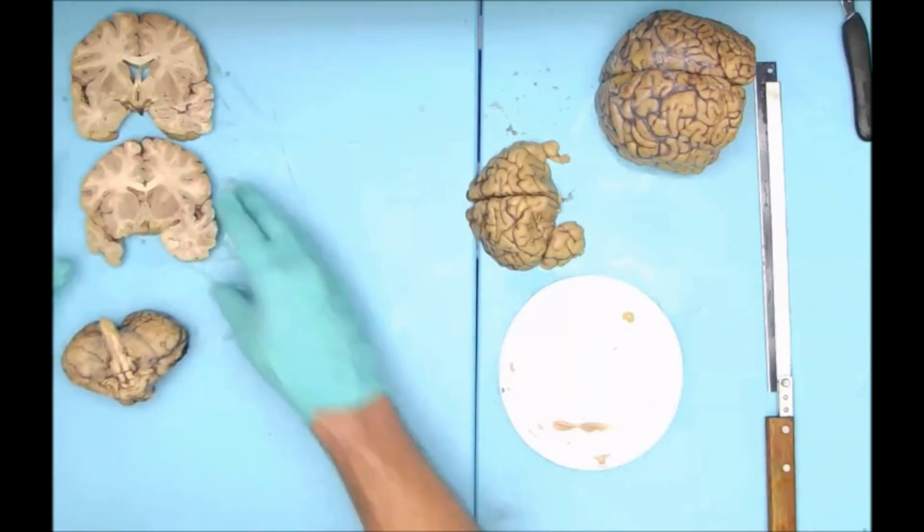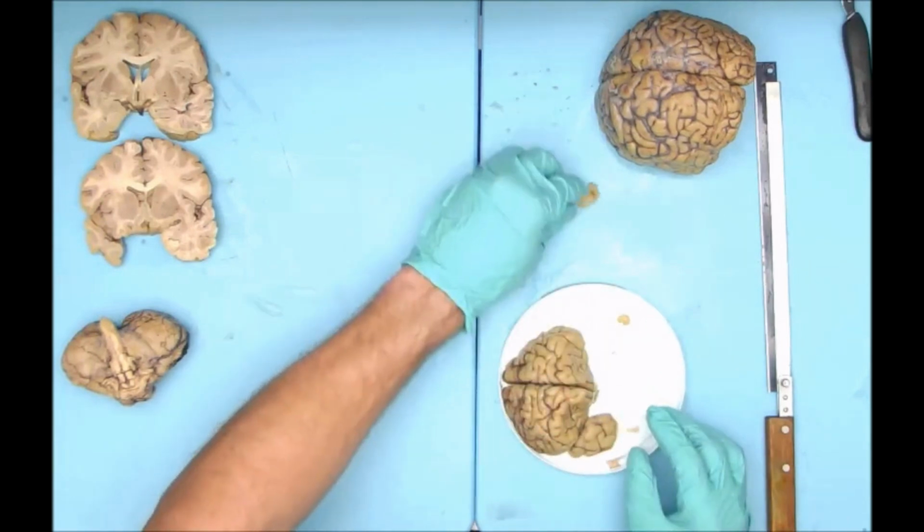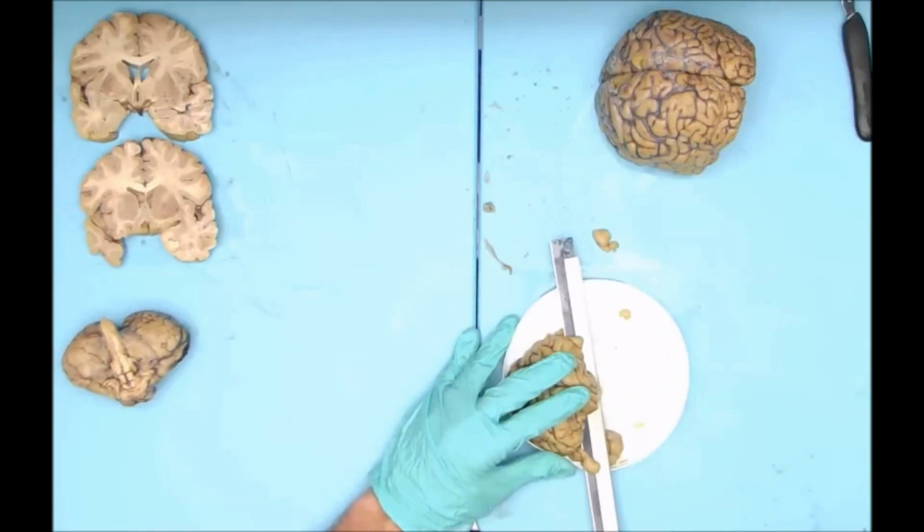So I'm flipping the slices once again. And it's real important to keep the orientation the same and do the same thing with every slice and how you orient it on the cutting board.